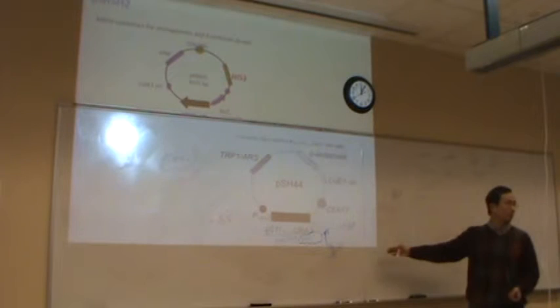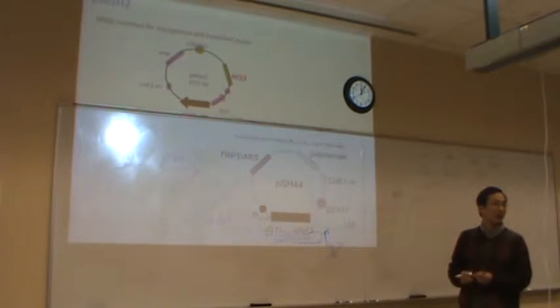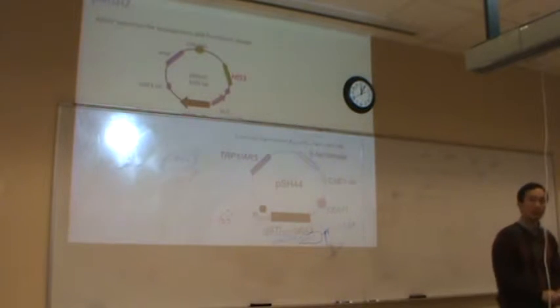And then there's a mutant we want to put. Mutant, what's your mutant? 422. No, that's not the mutant, that's a strain name. What's the mutation we want to study? Ours is MS371.